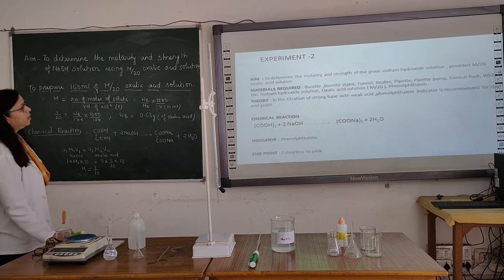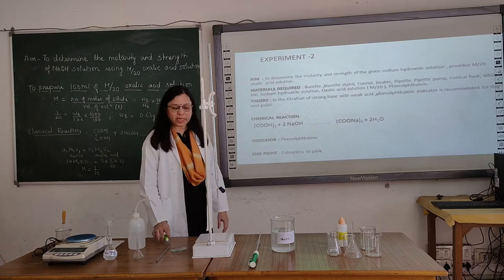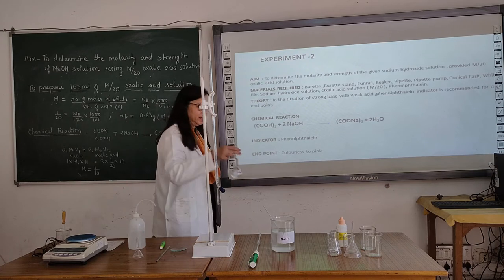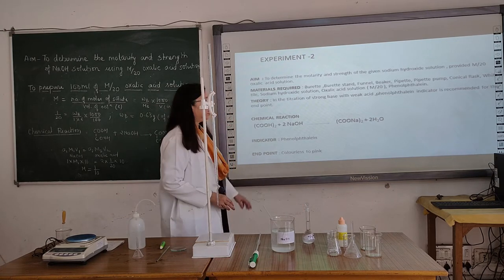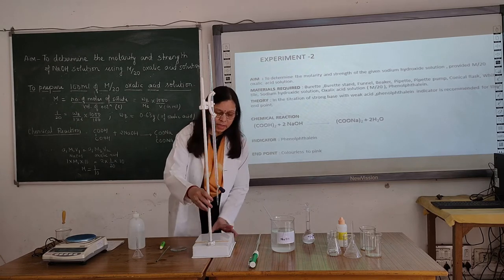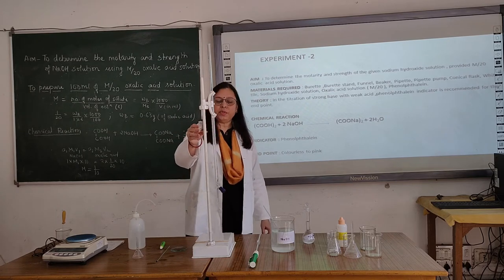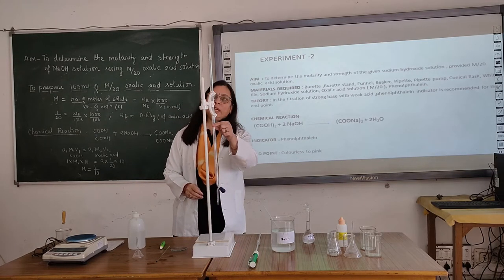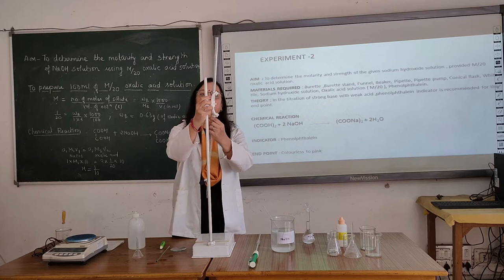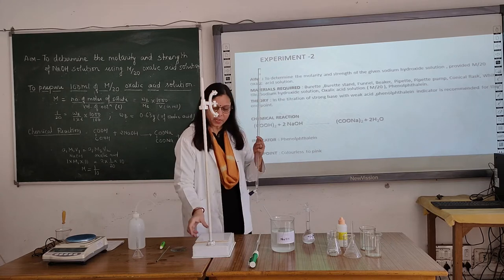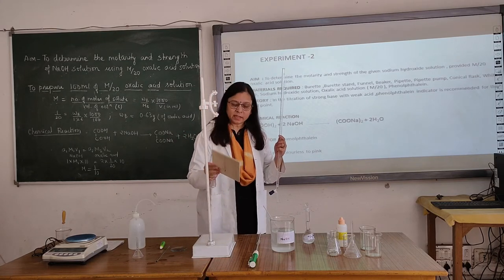The next experiment is to determine the molarity and strength of NaOH solution, provided M/20 oxalic acid solution. Now we will perform this experiment since we have prepared M/20 oxalic acid solution. Let us acquaint ourselves with the apparatus used during this volumetric analysis or titration. This is known as a burette. I am taking it out from the burette stand. This is the burette stand, and this is a white tile which is kept over the burette stand to have a clear view of the color change.